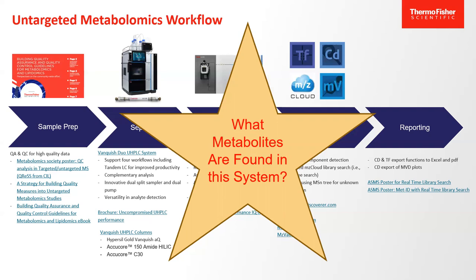Going untargeted is best when you're working with a system outside of the norm. If you're doing human metabolomics, you can probably do pretty good targeted work. You're doing plants, you're doing bacteria, you're doing nematodes, they may see very, very different small molecules that may not appear in a targeted panel. And you want to figure out your particular system, what are you looking at?